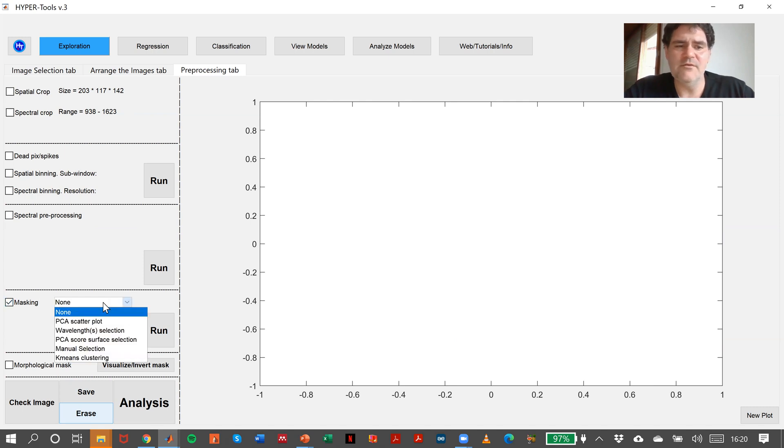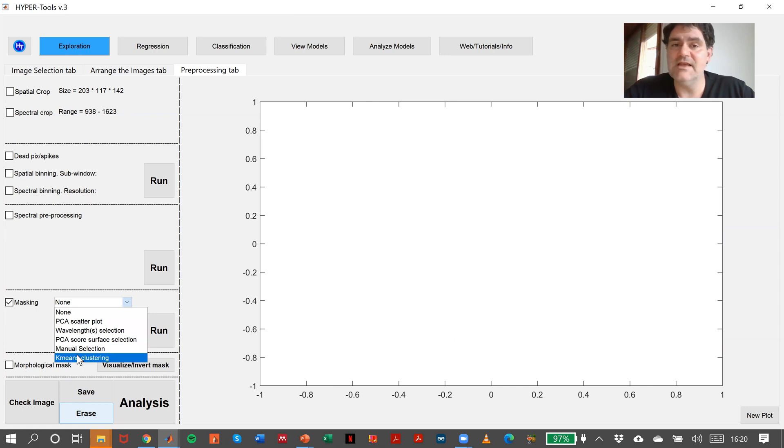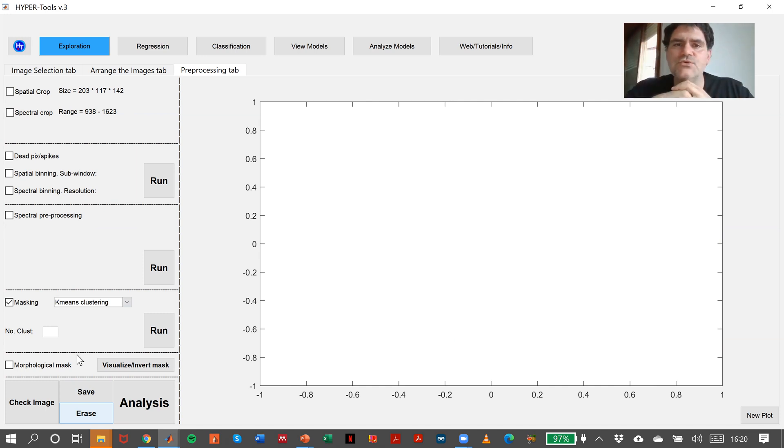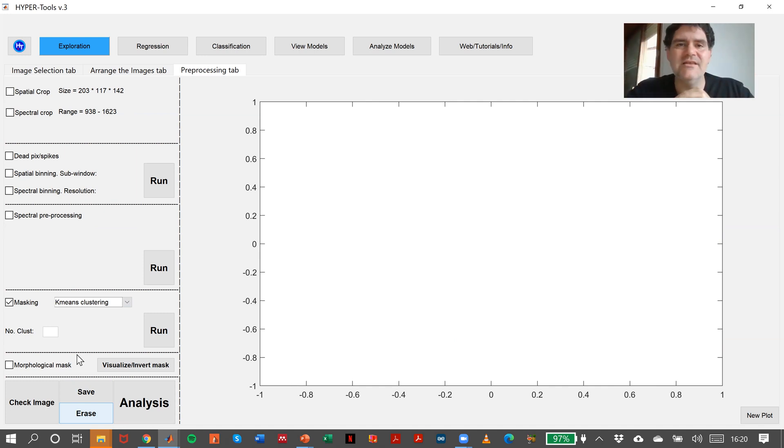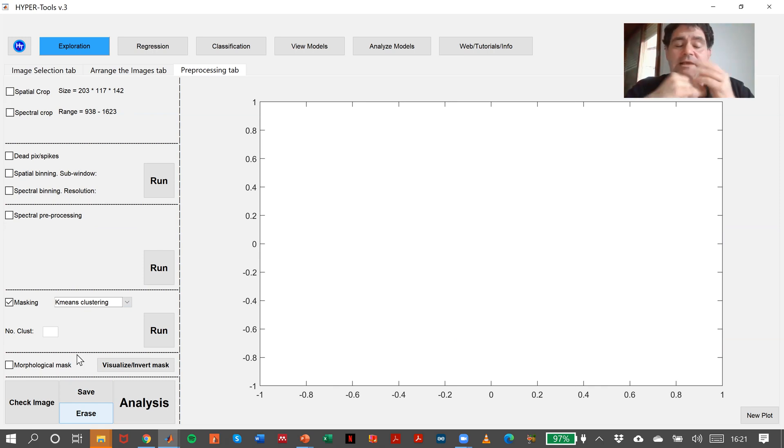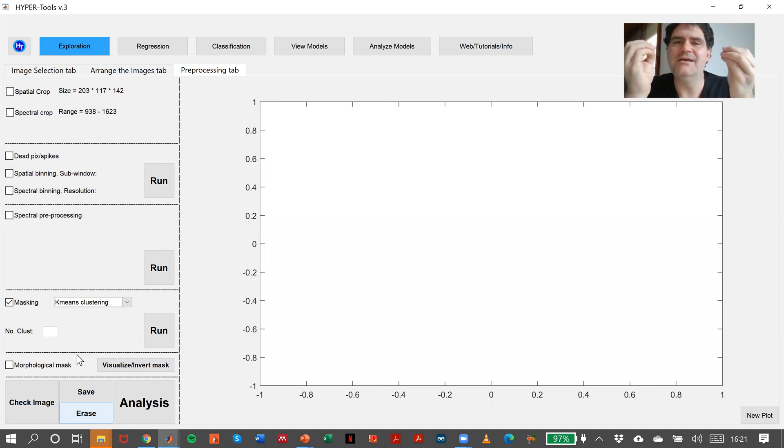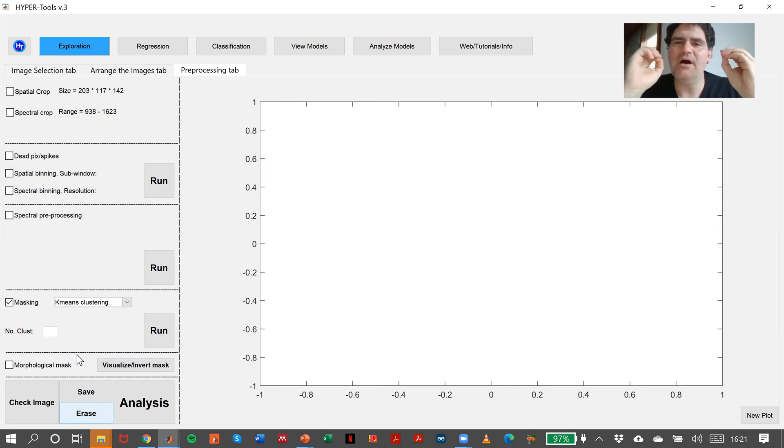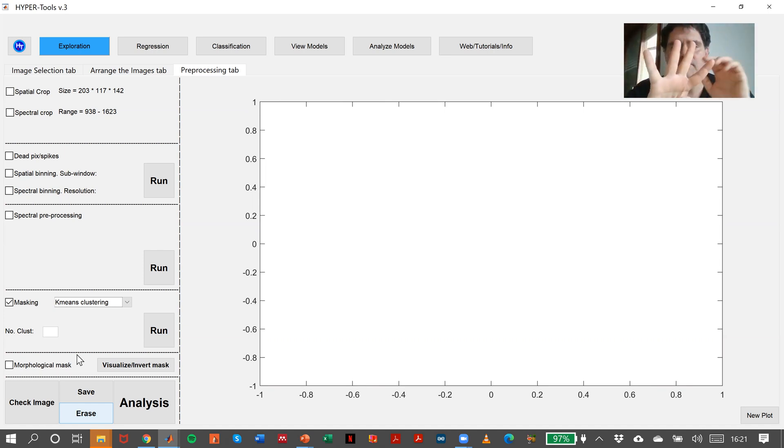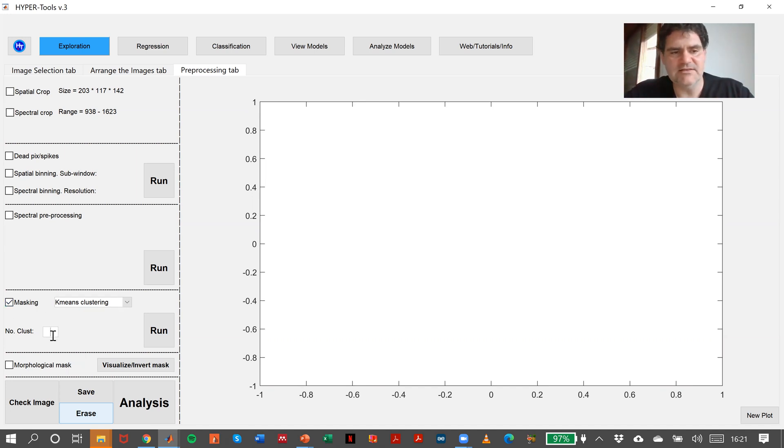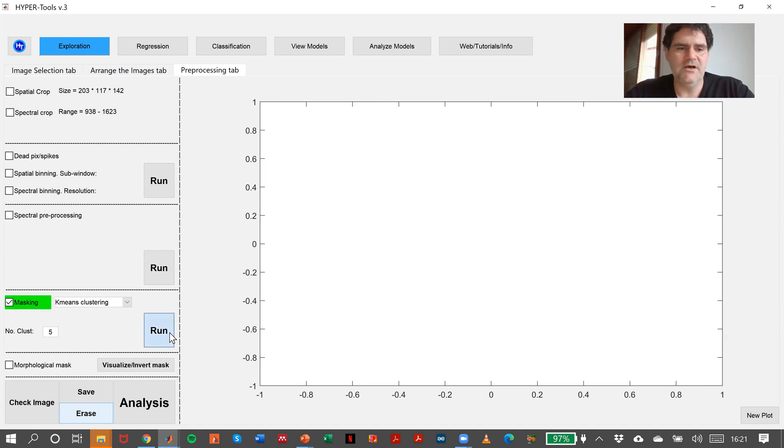One of the masking methods that I like a lot is K-means clustering. K-means is an analytical method. In this case, we group pixels due to their similarity, Euclidean distance or Mahalanobis distance. I'm not interested in making something analytical, I'm interested in removing the background. So I can think I have four plastics and one background. Let's see what happens if I say number of clusters, five.